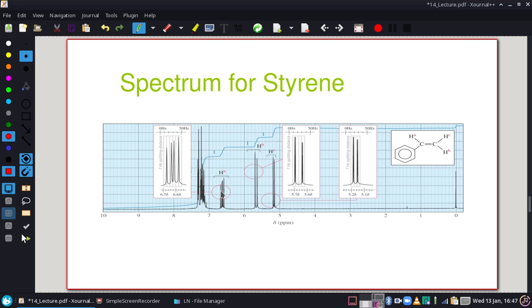But all right, even though it looks like these 3 patterns are quite complex, technically they're not, because about the only time I see all 3 of these quartets is if you have a CH double bonded to a CH2. This needs to be connected to something, but that structure gives us these 3 sets of complex split peaks.